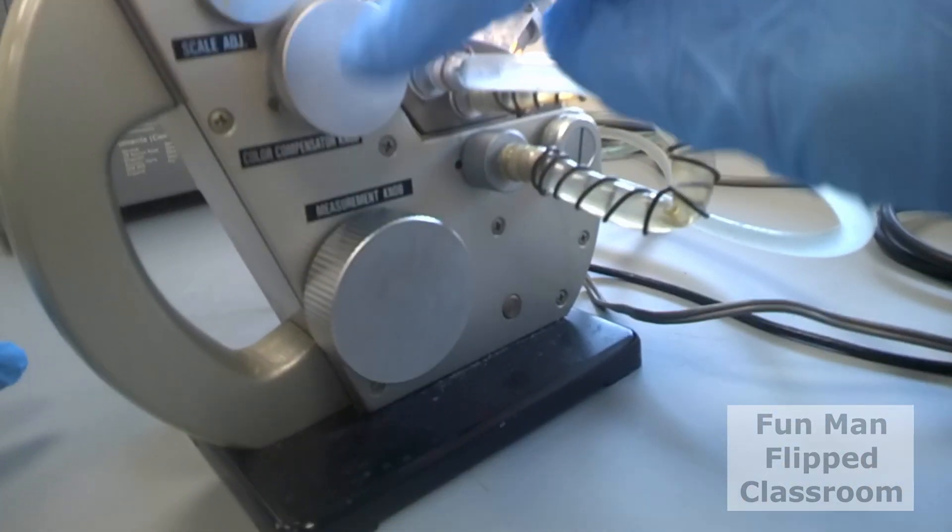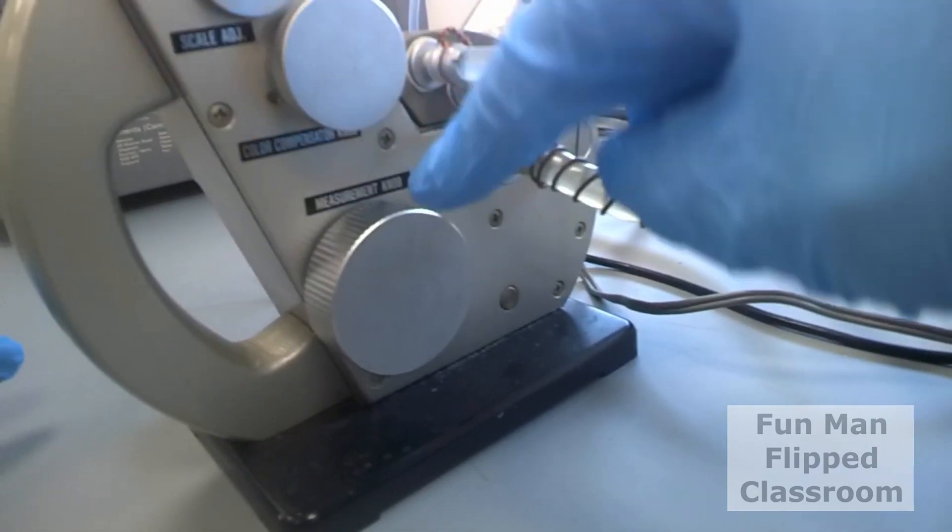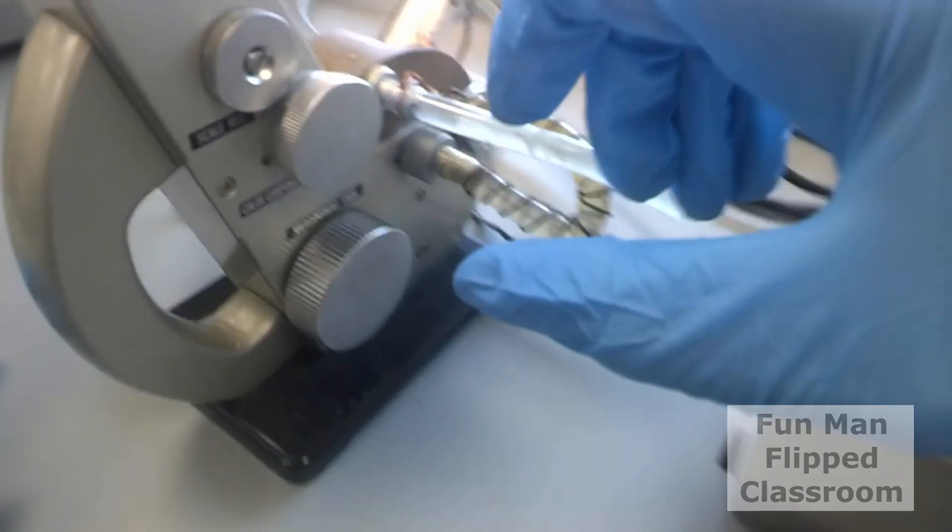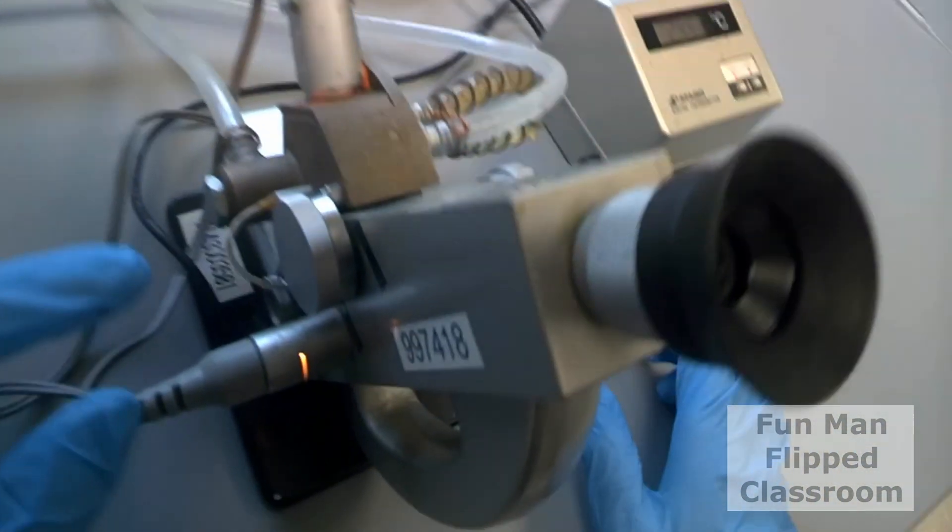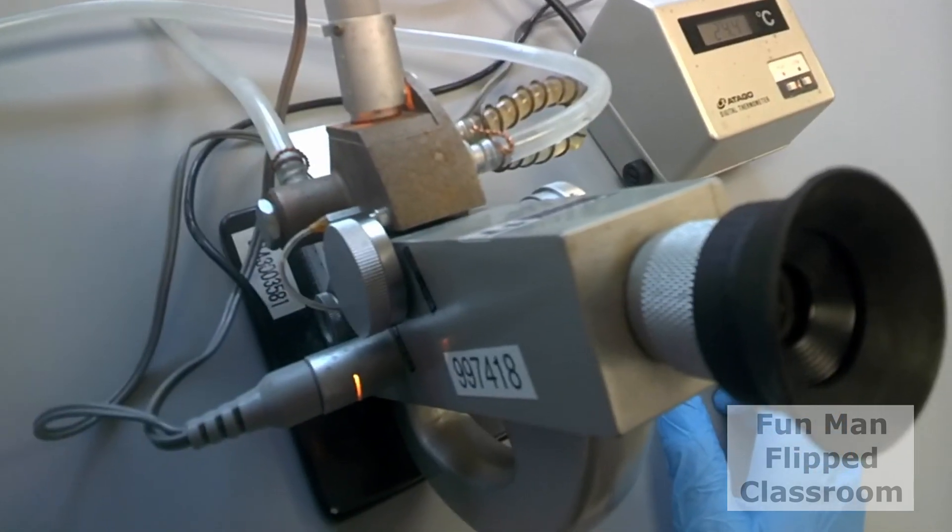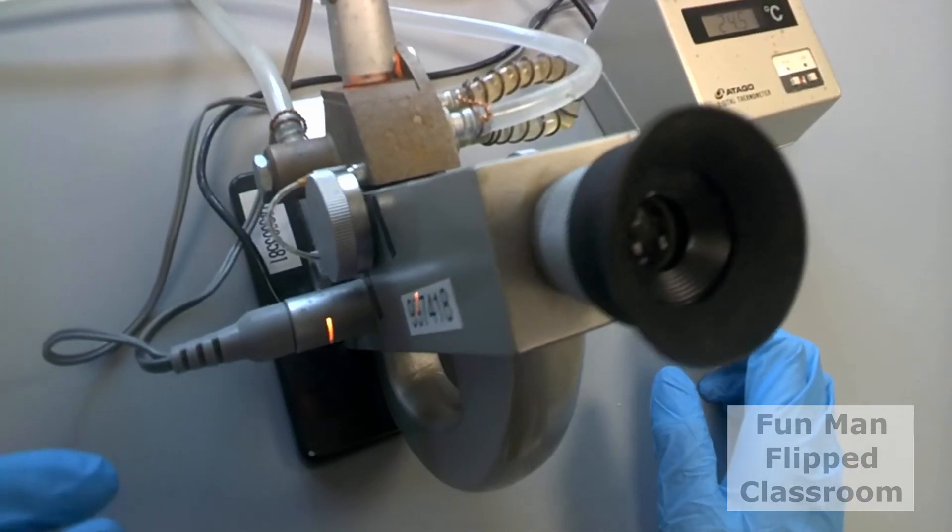Now first, the color compensation knob. Next, the measurement knob. Both knobs will be adjusted using your right hand. On the left, there is a prism switch. Open and close the switch. It is super old school, but it's so robust.